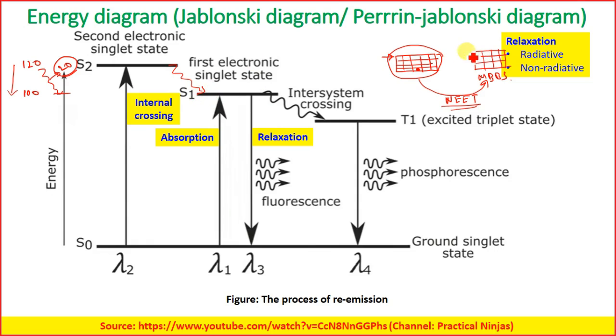But it is happening within this system. This transition may also happen while it is losing the energy. That means its wavelength is going up.